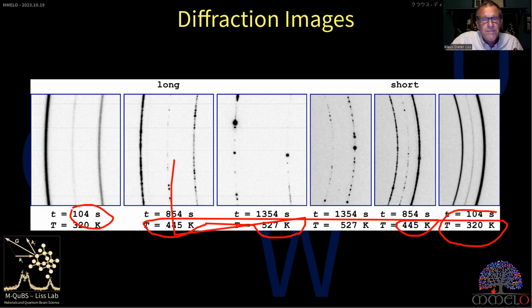So if we have isotropic distribution in orientation space, then we can estimate the number of grains in the illuminated volume, doing a little bit of crystallography and also considering the mosaic spread. That means how sharp a line is. If a line is not that sharp, it spreads out in reciprocal space. So then we get a distribution.